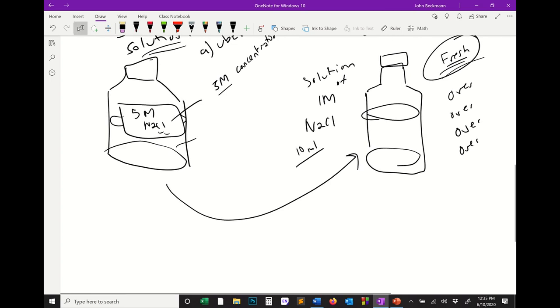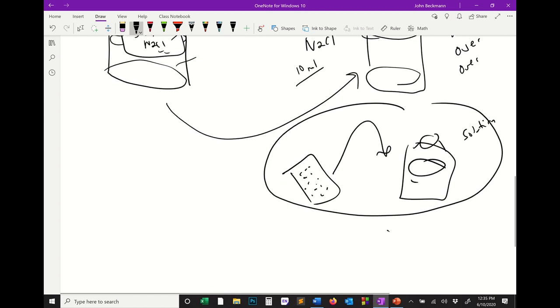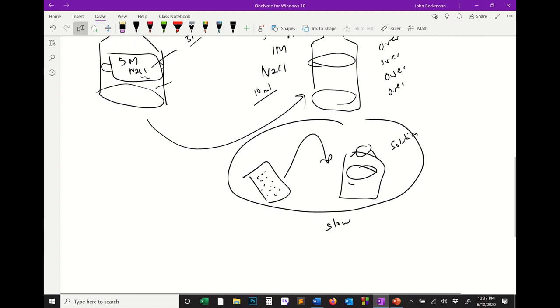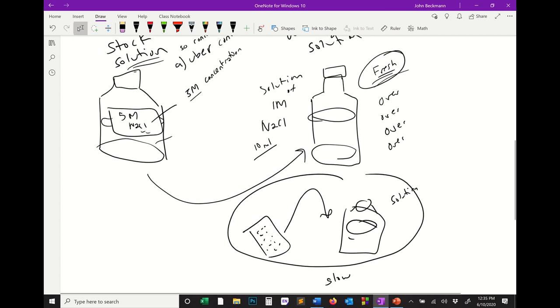And to make a solution, what you would do is you would weigh out the powder. You would put it into your solvent. And boom, you got your solution, okay? Now, the problem with doing it this way is it's not fast. This is very, very slow, okay? It's slow to have to go to the scale, weigh out the powder, put it in the solution, dissolve it, and sometimes it actually takes quite a bit of time, okay?